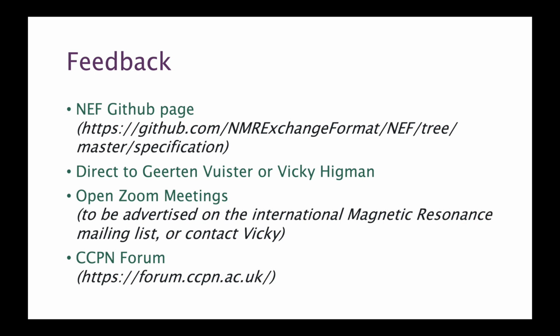We are keen to emphasise that although CCPN has put forward this proposal, and we have a strong interest in using and encouraging others to use the NMR Exchange format, this is not a CCPN thing. NEF belongs to the community, and we want and need everyone's participation in moving this forward. The NEF GitHub page has more information about the NEF Consortium, including a copy of the Charter.